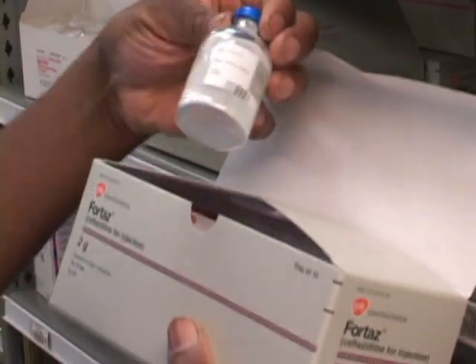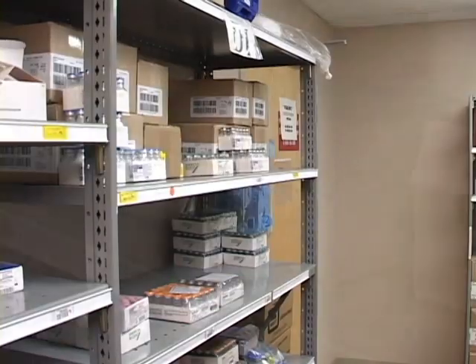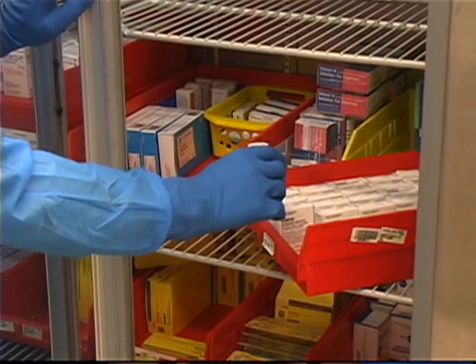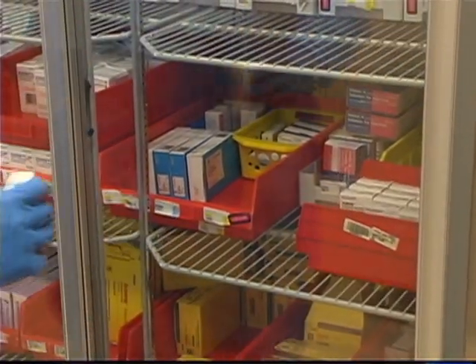Just as important as checking the product label when a prescription or medication order is filled, taking care when receiving pharmaceuticals and accurately placing them in their storage locations is essential. You should read product packaging carefully rather than rely on the general appearance of the product, because a product's appearance may change frequently or be similar to other products. Technicians play a vital role in minimizing dispensing errors that may occur because of human fallibility. As a technician, you are generally the first in a series of checks involved in an accurate dispensing process.